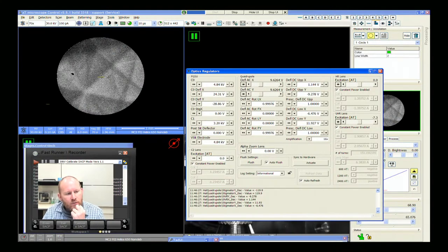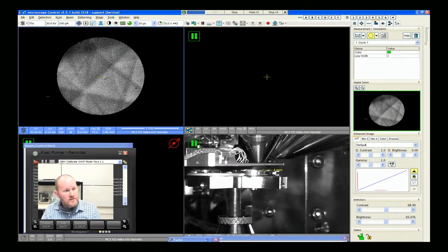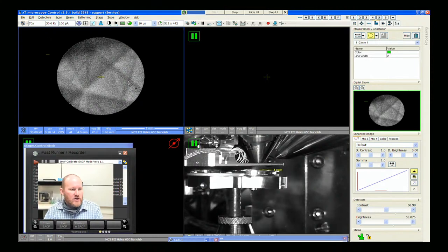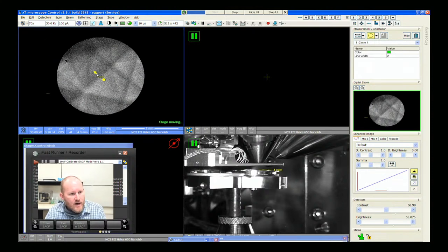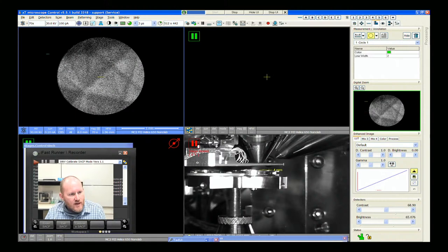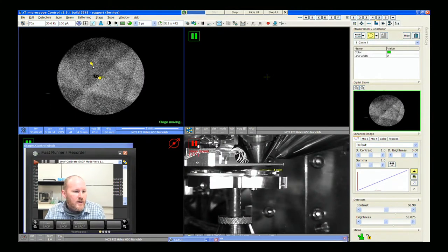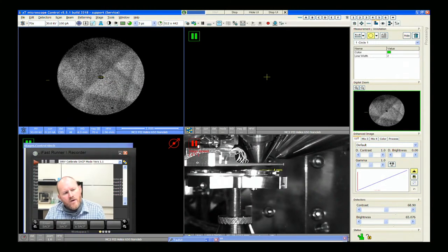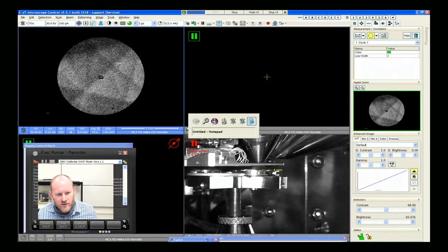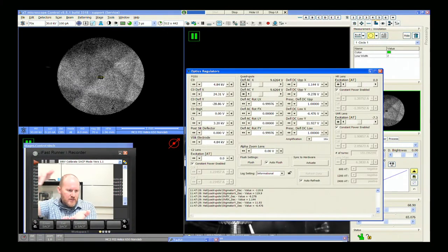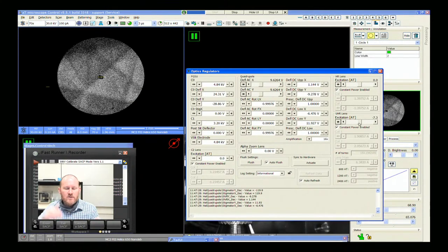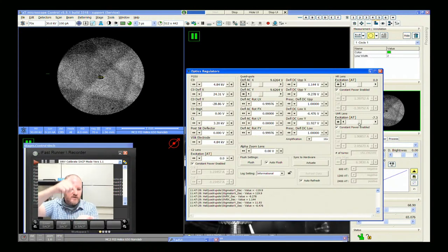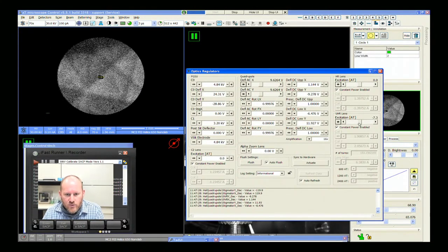That's why we're seeing this ECP — this is a scanning ECP, electron channeling pattern. We want to change that from a scanning ECP to a rocking ECP. I'm going to utilize debris on the surface to help us. We see some patterns, we see some features — clearly we're just scanning the beam across a really large semi-angle. First step is now what we need to do is: as we're scanning, at the edge we want to enter an objective lens field that will pivot the beam back towards a rocking point. So we're going to take the UHR lens to maximum.